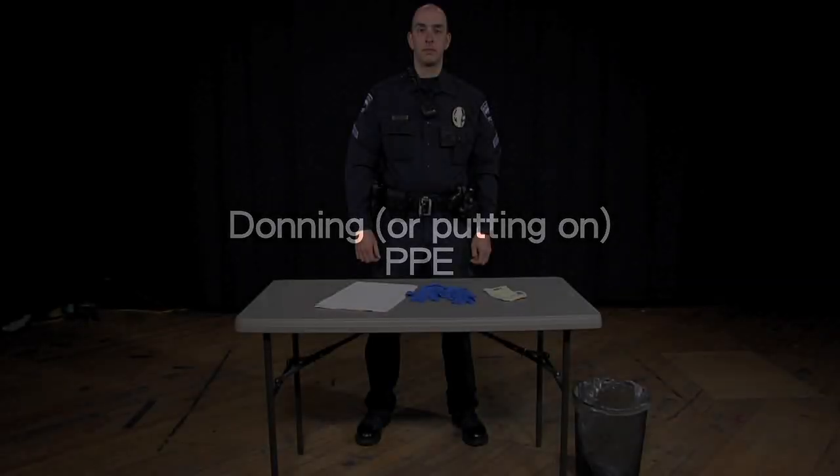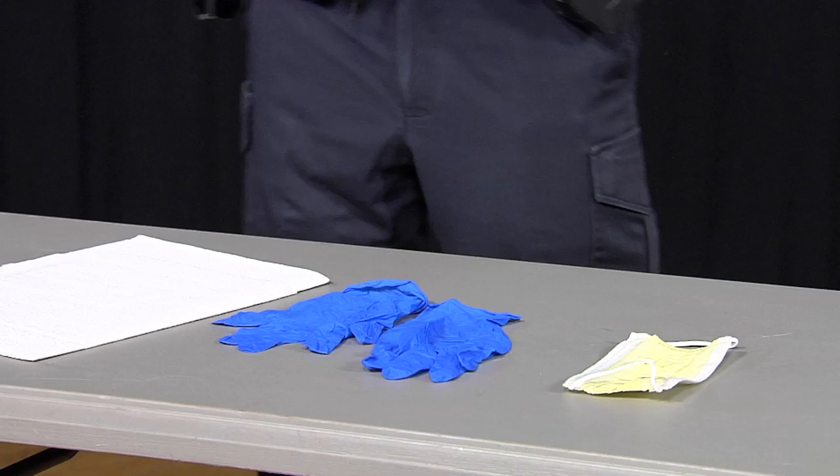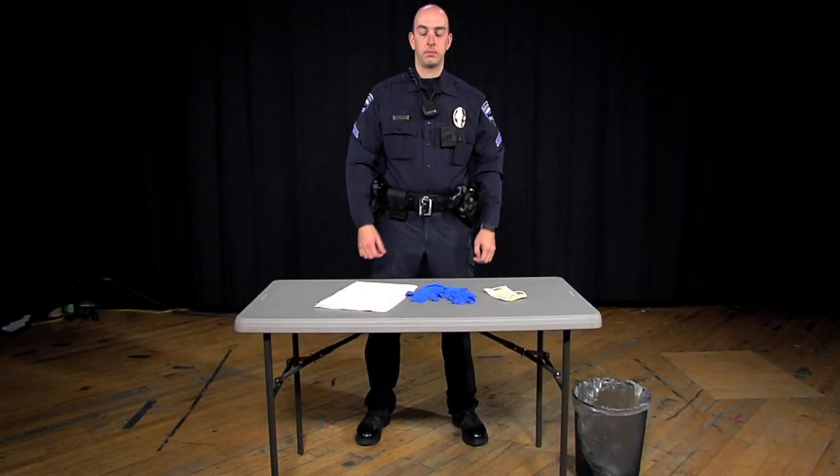We will now demonstrate how to properly don and doff personal protective equipment, or PPE, for drug testing. You will need gloves and a face mask. A gown or apron is not required, but it is an extra precaution to avoid any substance getting on your clothes. Eye protection has not been included because the primary exposure routes for fentanyl are through the skin and inhalation. Adverse effects due to eye exposure are minimal.